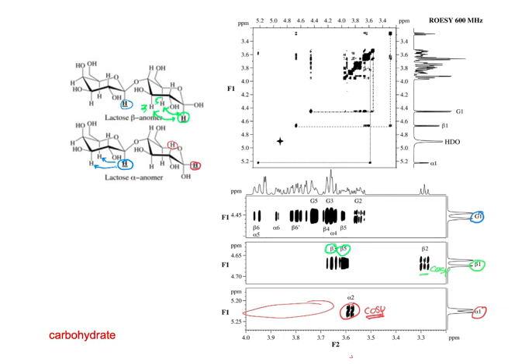Does it flip in space and have more NOE with other protons as well, or not? For example, it flips from the anomeric carbon to the oxygen, and then has NOE with others. If it's ring flipping, I think it can, but in this case, I think there'd be one conformation that's more favorable.